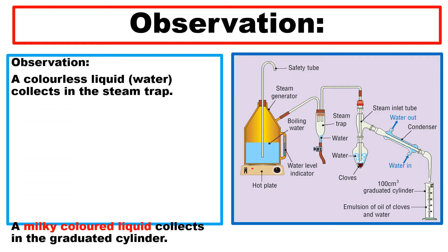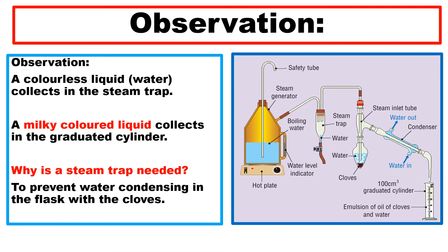After about 40 minutes, you will observe a colorless liquid — water — collecting in the steam trap, which is the middle part of the apparatus. A milky-colored liquid collects in the graduated cylinder at the bottom; that milky emulsion is a mixture of clove oil and water. The steam trap is needed to prevent water condensing in the flask with the cloves.